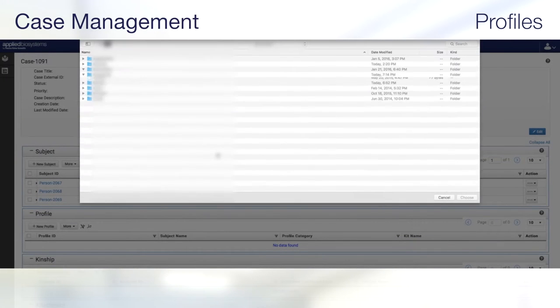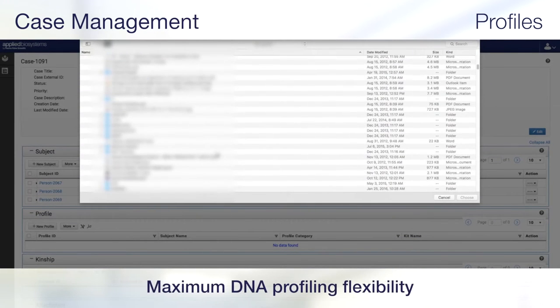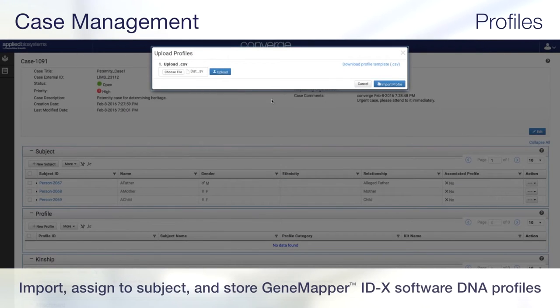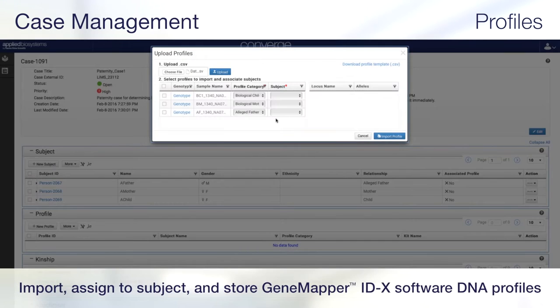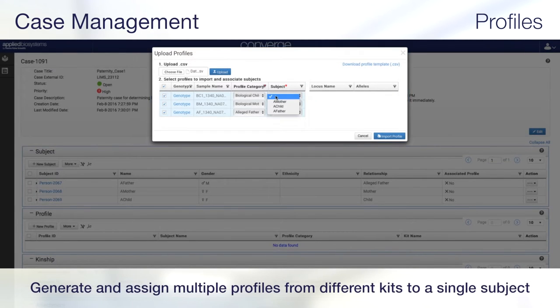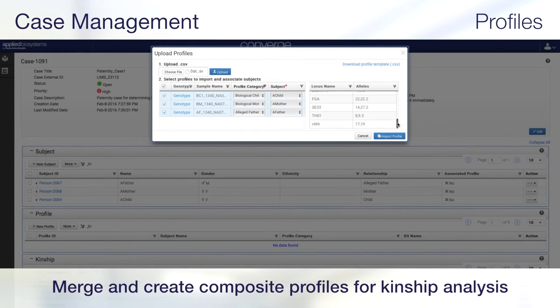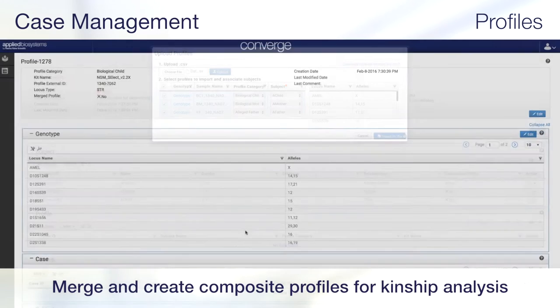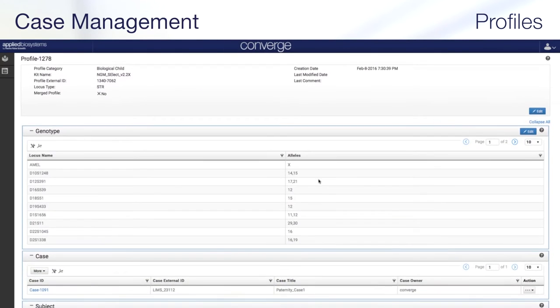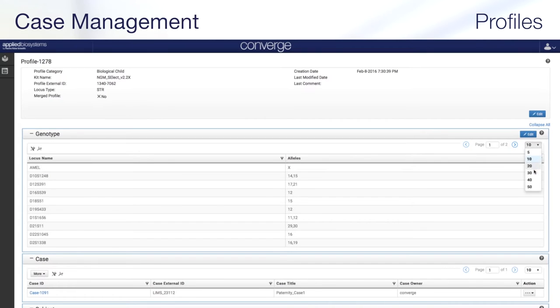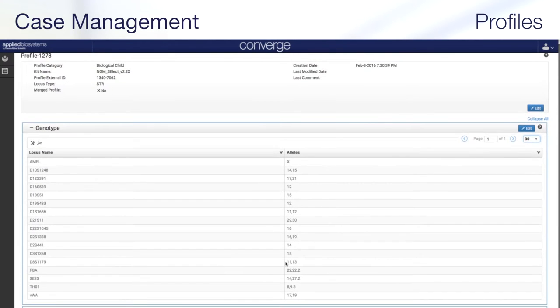Converge Software also enables maximum DNA profiling flexibility. Exported DNA profiles from GeneMapper IDX software can be imported, assigned to subjects, and stored in Converge. Multiple profiles utilizing different chemistry kits can be generated and associated to the same subject. Converge Software also offers the ability to merge profiles and create a composite profile that can be used in kinship analysis. The DNA profile, along with its metadata, including the kit used to generate the data, is preserved and can be viewed in the profile page.